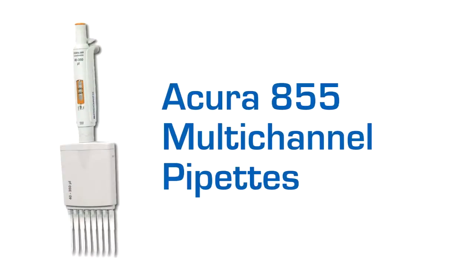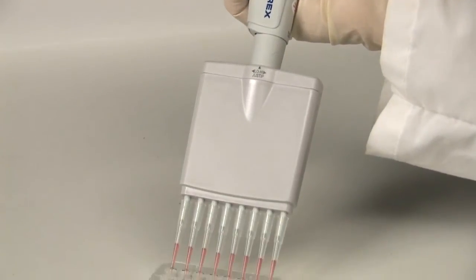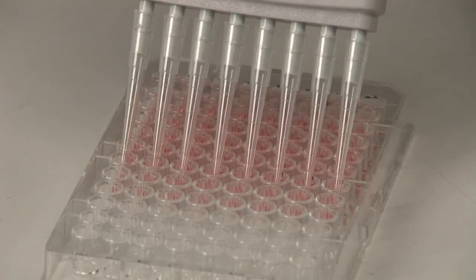The Acura Manual 855 multi-channel models come in both 8- and 12-channel models to enable high-throughput pipetting with microplates.